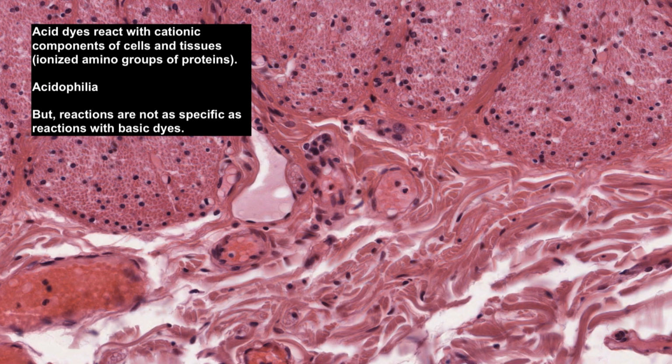So with this background knowledge, in the next short lecture in this series on histological stains, I will show you a few images to illustrate what I've been talking about. This image, by the way, is showing you collagen here and smooth muscle here, but don't worry about this at this early stage in your histology course.